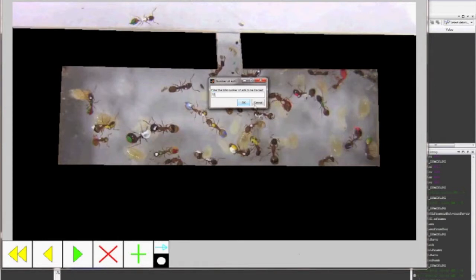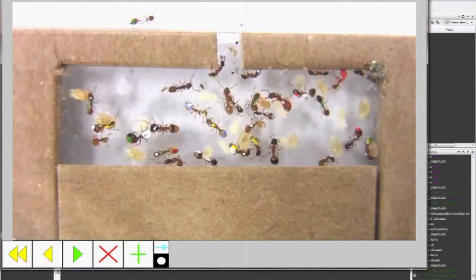You will then be prompted to enter how many total ants you wish to track. This number should be the maximum number of ants on the screen at one time. When you are done, press OK.